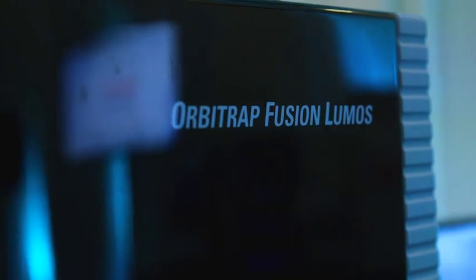I know that these tools seem to have been developed primarily for biological applications, but what we're finding is that especially features such as internal calibration, which can give us routine mass accuracies less than 1 ppm, this really just blows the doors off our ability to identify compounds from scratch in really complex systems and do that in a comprehensive way, unsupervised.